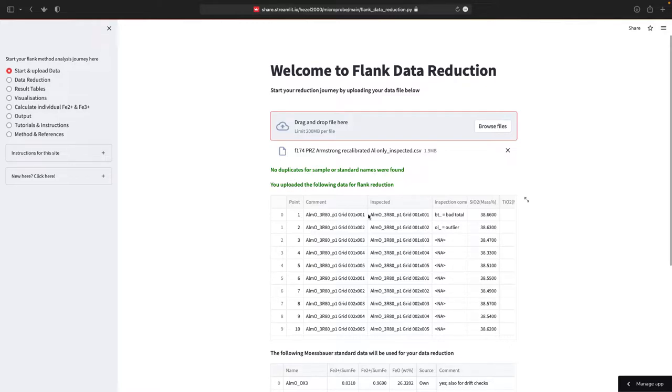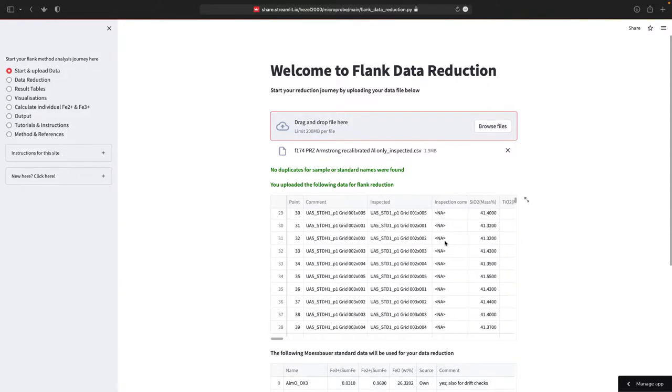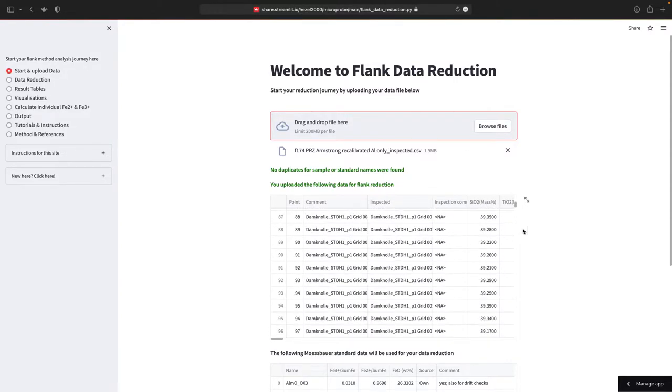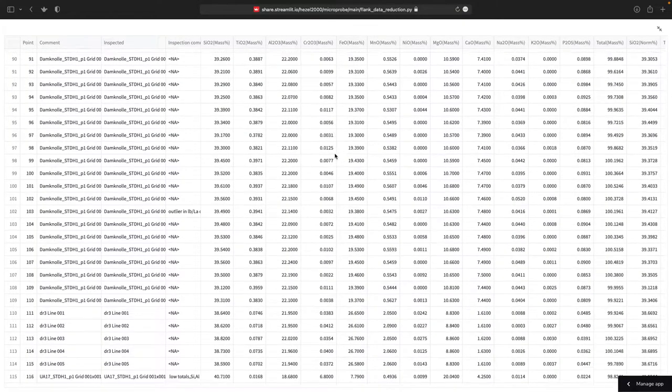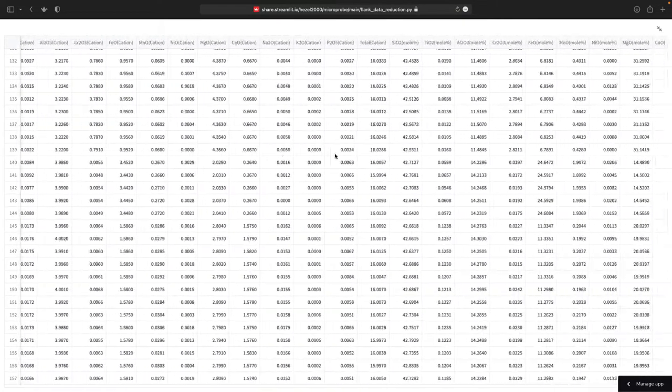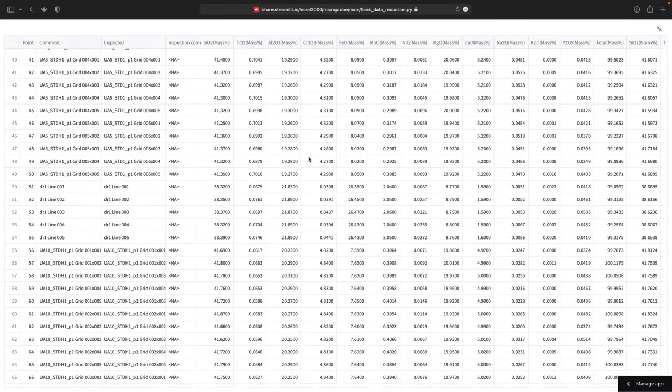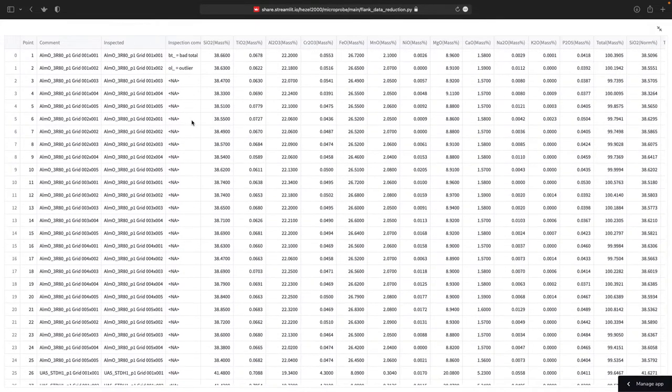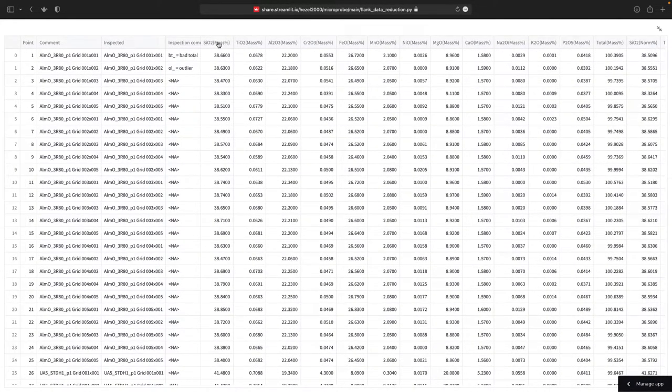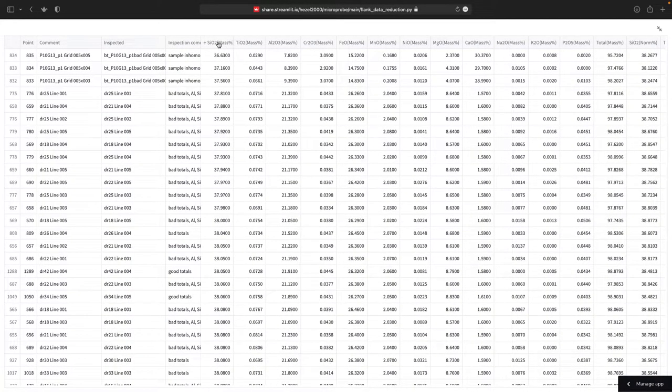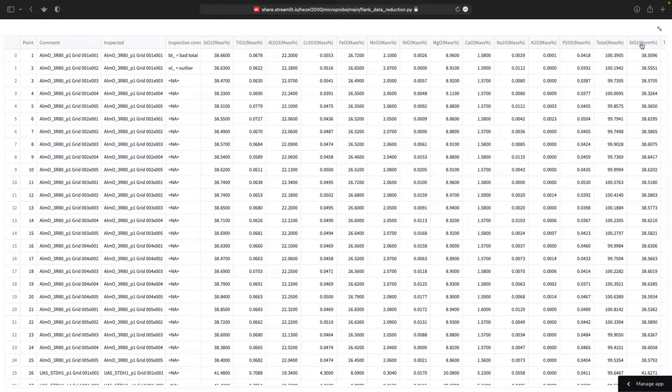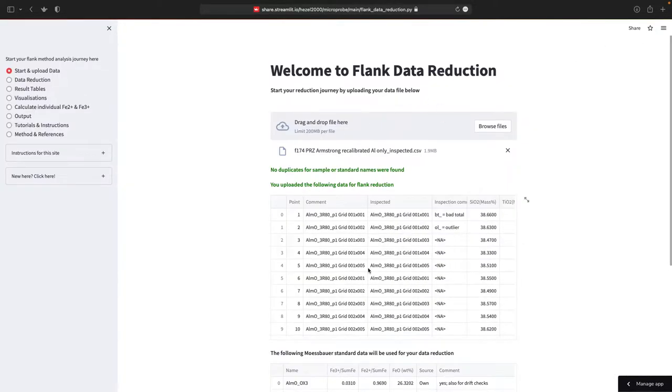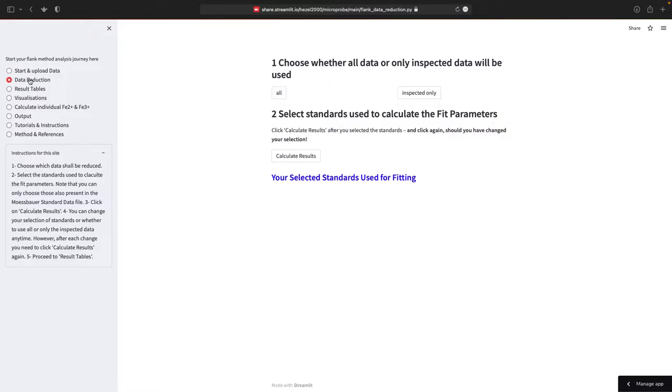And now you see the data you uploaded here. You can navigate through it, you can make it bigger so it's the entire screen. You can look at all your data, you can sort it via a certain column and so on. Once you're happy with this, go to data reduction. And again, here's instruction for this particular site. Then go to data reduction.